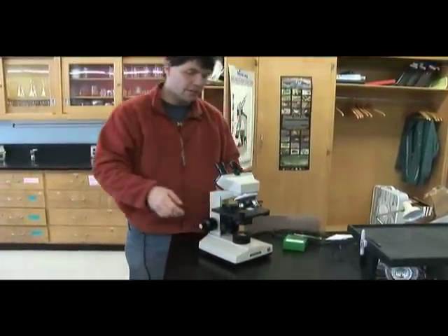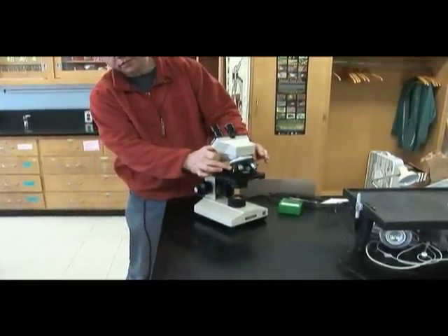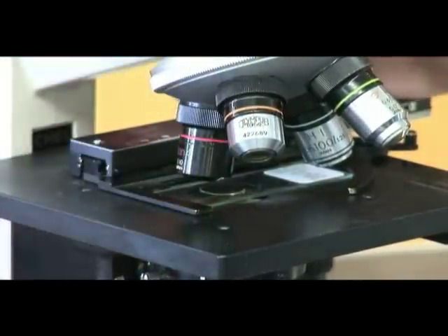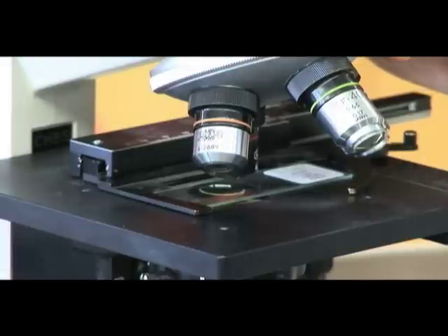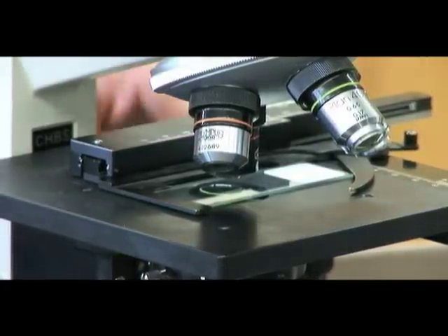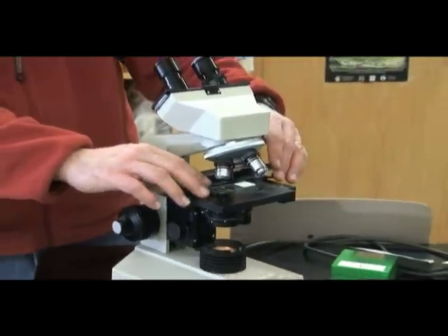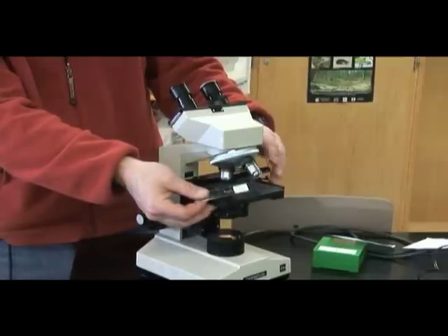Also, at the end of each lab, I want all of the scopes to be on the lowest power objective. Some scopes may be missing an objective. Please do not put the nose piece in a position where the objective lens is blank, because when you look through, you won't see anything. The other thing that is good to do is to lower the stage as far as you can to allow the next person access to it. And then finally, always remove your subject.